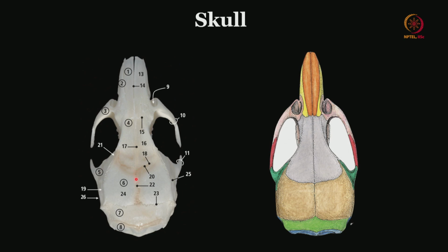That is called bregma, and a similar point posteriorly is called lambda. It is the Greek letter lambda, the shape, including the vertical midline sagittal suture and the lambdoid suture. It is an inverted Y, just like lambda. So that is the lambda point. Bregma and lambda, these two points are very vital in order to calculate any coordinates that you are thinking of. So it will be in relation to bregma, how many millimeters anterior to it.